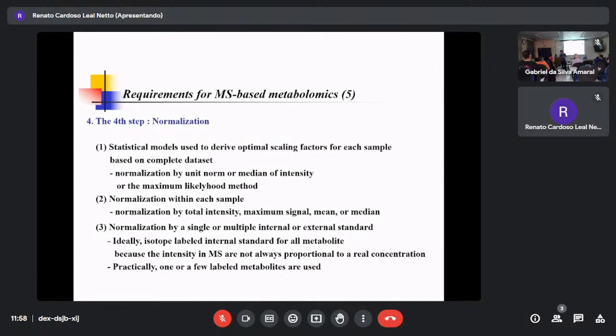Here, this is expensive. So that's why the first normalization is to the internal standard. I measured here, like gas chromatography or chromatography, and I added an internal standard here. All the signal intensities are divided by the internal standard. Then we can normalize the signal. You understand what I mean?